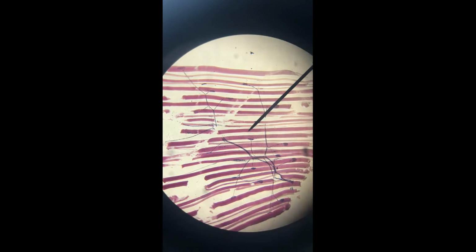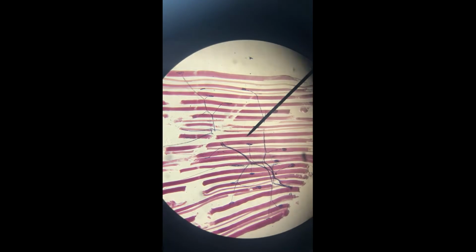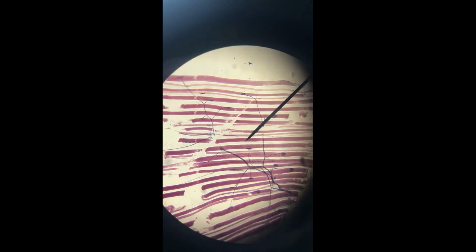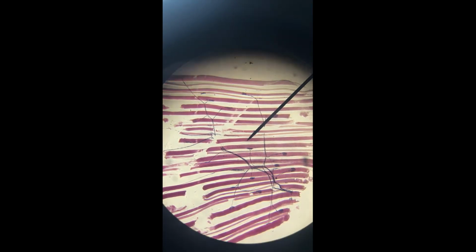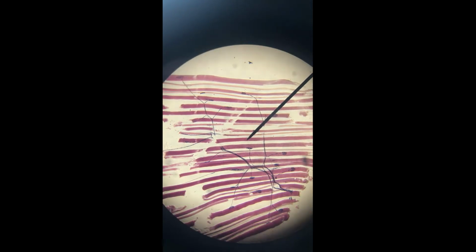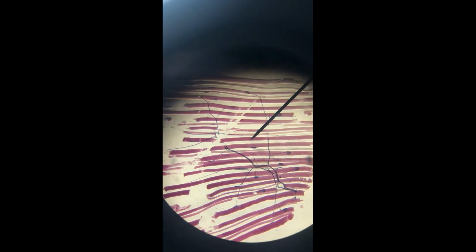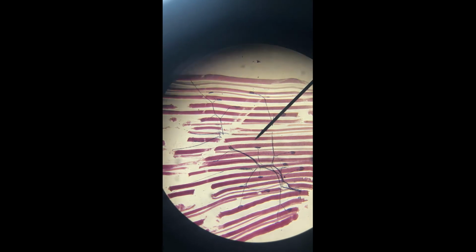So I decided to show you some other cell types because what we're looking at right now are two of my favorite cell types. The pointer is on a single skeletal muscle fiber. These cells are huge. They have all these really cool specialized organelles that help you contract. So that'll be lots of fun for you to learn about. The other things are the neurons that are sending the signal to contract, and they're awesome. So both of these cell types can conduct electrical signals.